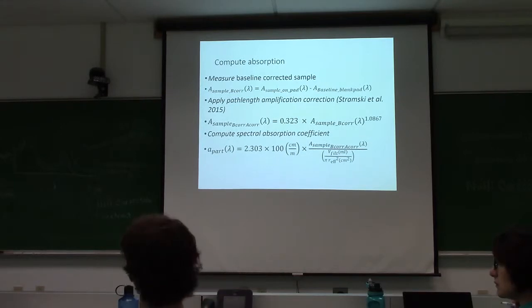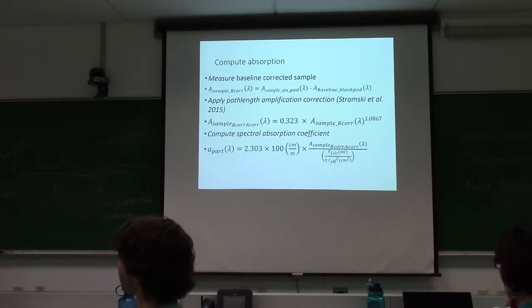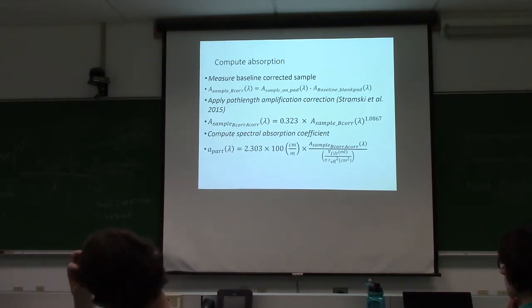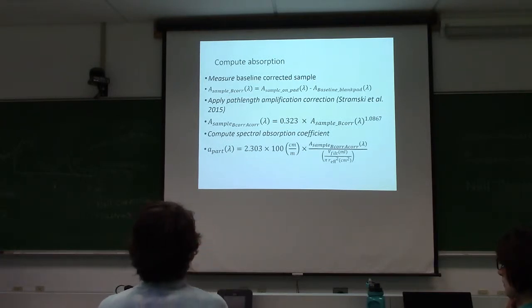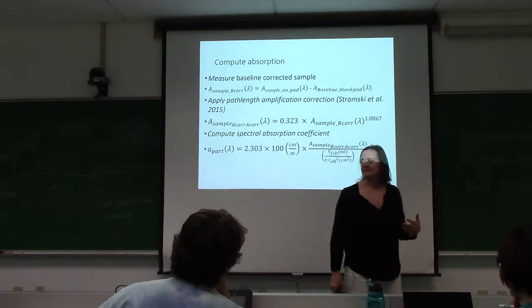Emmanuel's making faces at me. Yeah? Is there like anything else you do with the filter, like you're extracting to get rid of the liquid? We're almost there. I realized that I didn't finish that. I thought I was done with filters, but I'm not. Almost there. I'm leaving this as a question. We have everything within our capability to do this. Because we could get a high CDOM sample that we could measure in an integrating sphere in a cuvette. And we'll take a look. See how good the filter is. There are still so many questions to work on.